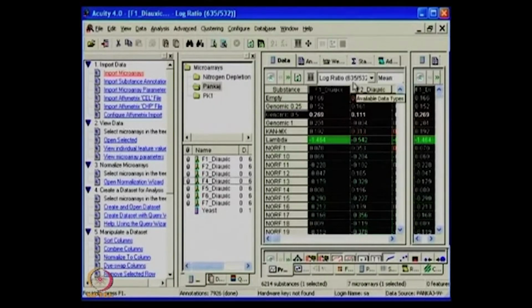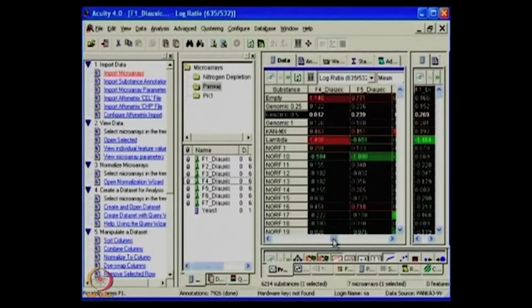So in context we have shown which kind of ratio you are using to check. Usually it is case over control that people report. So in this fashion, conventionally you can see the colors, but here there are many ones. There are many which we have opened now, six. So I want to see in a nutshell what is happening.